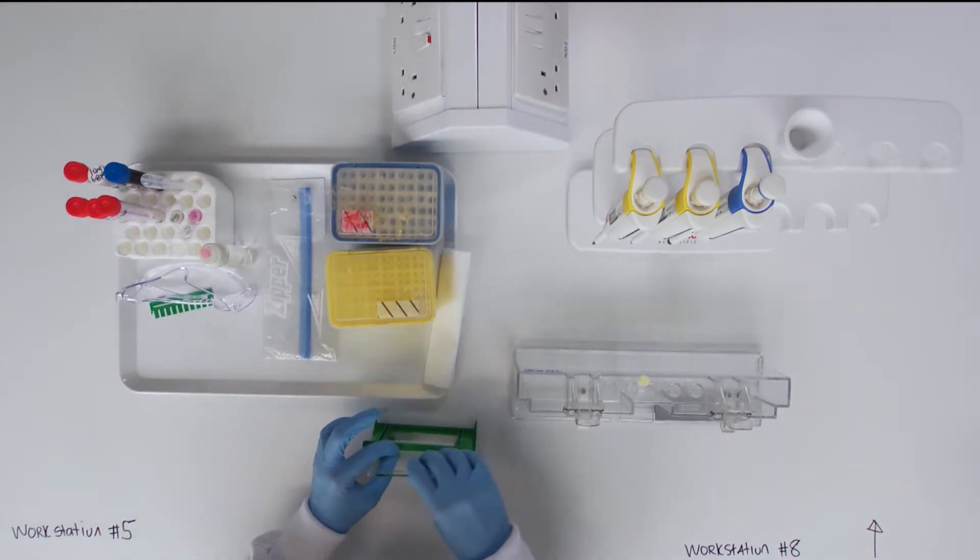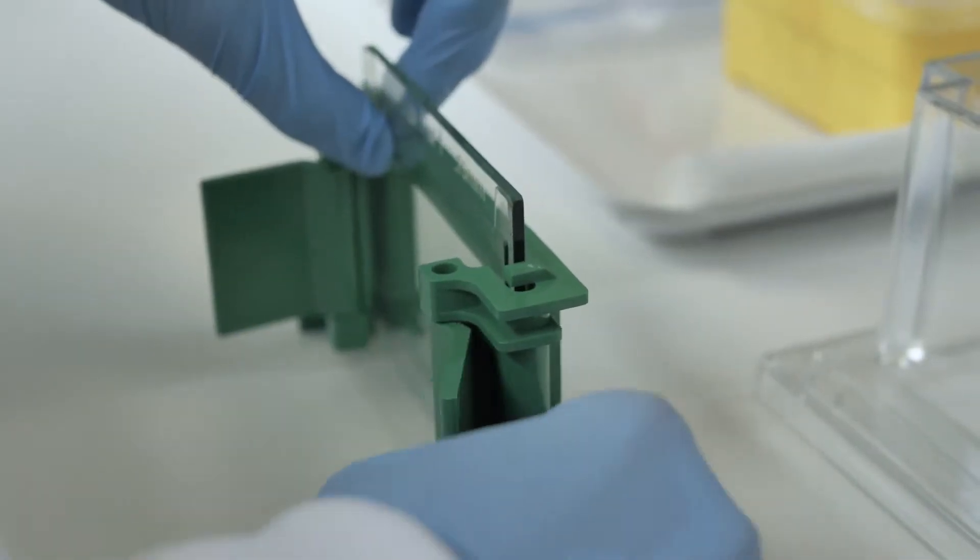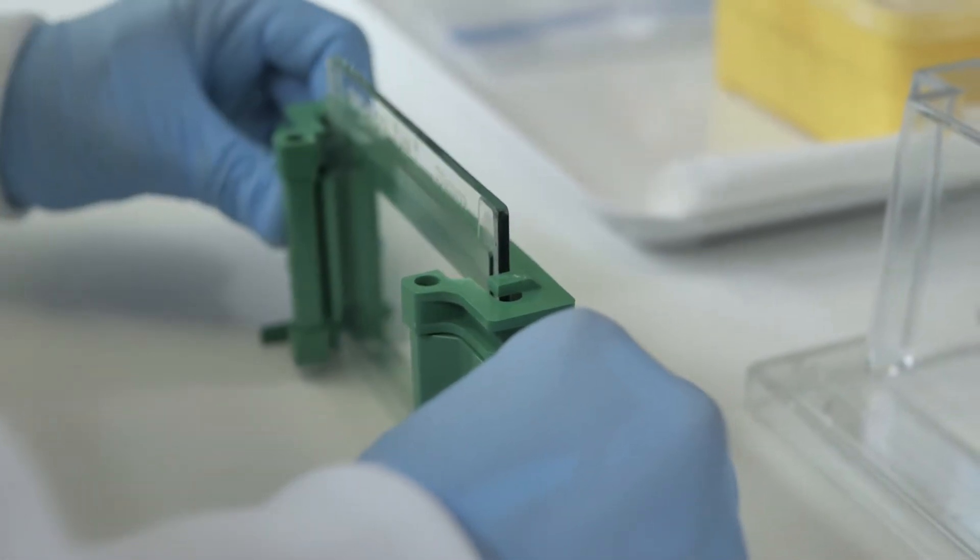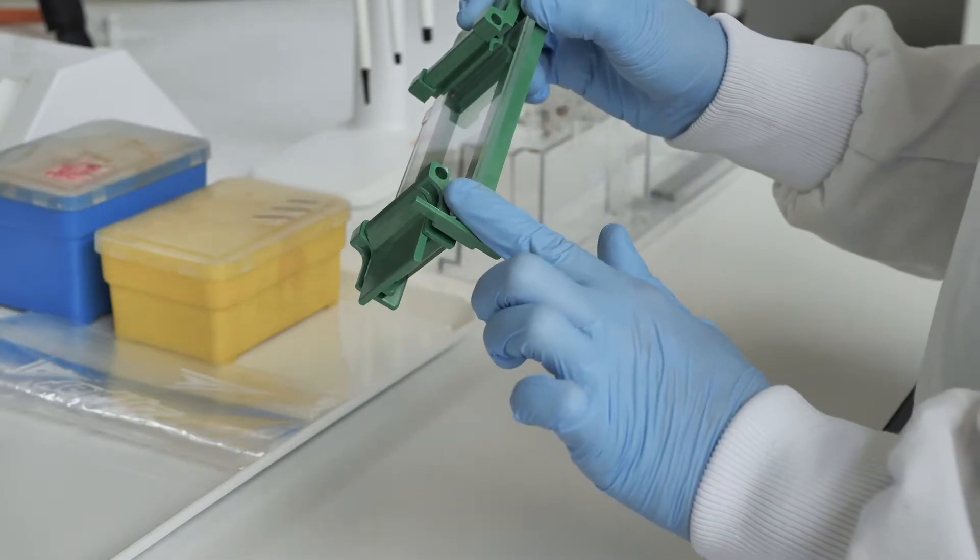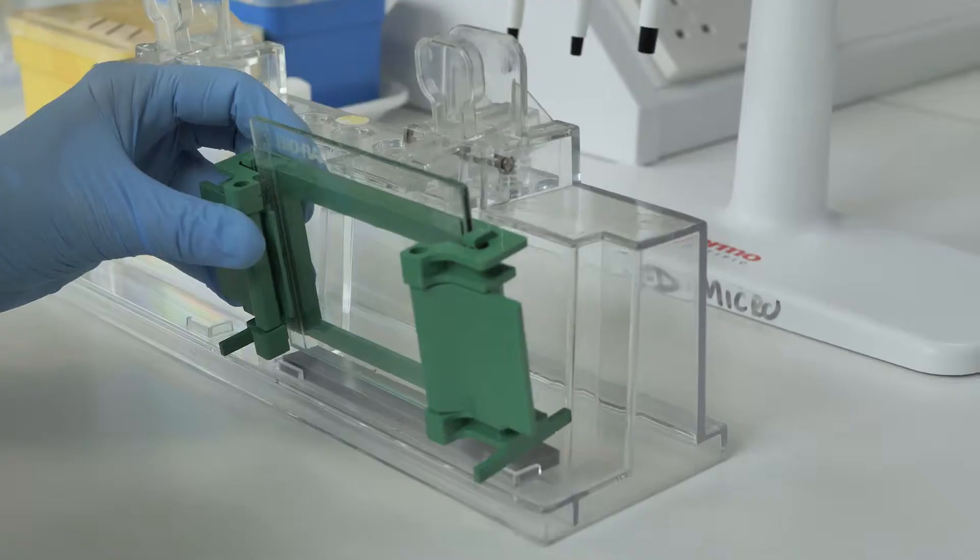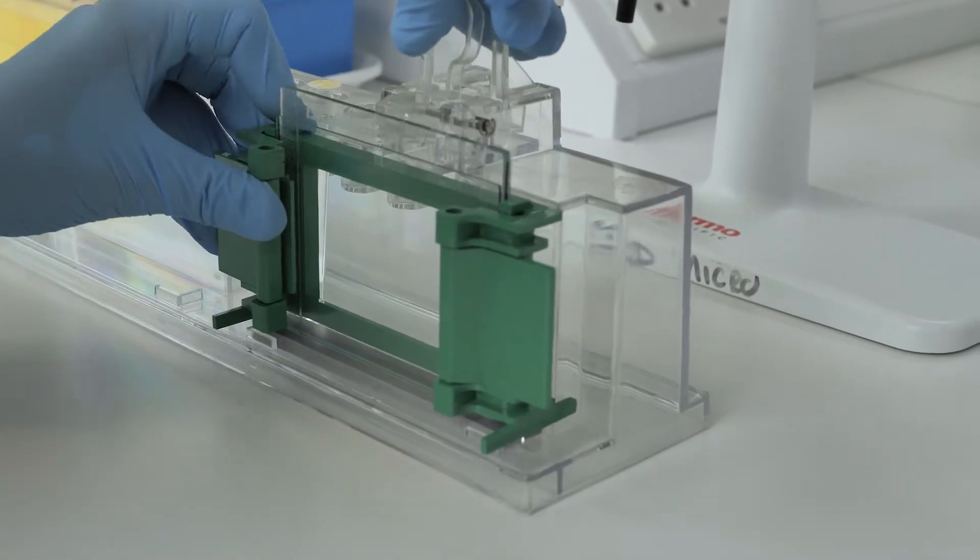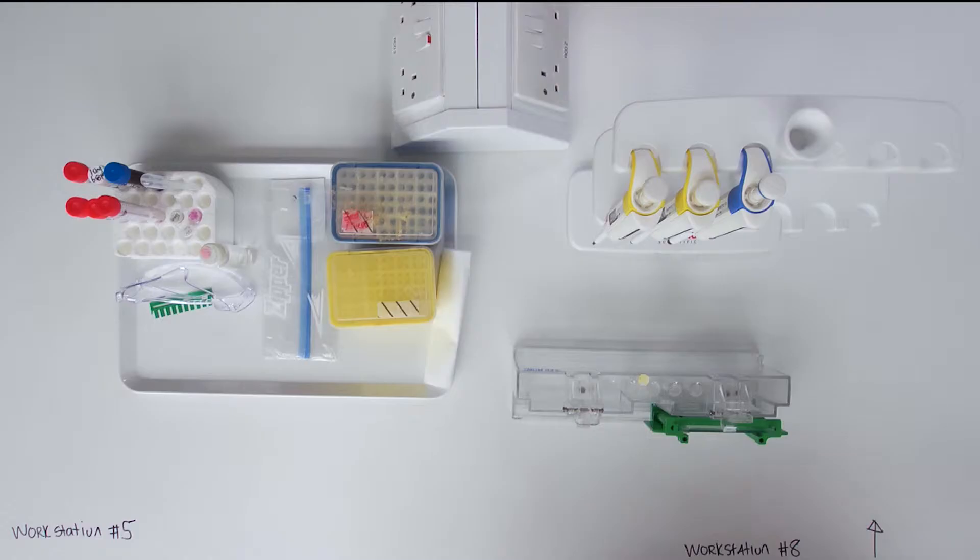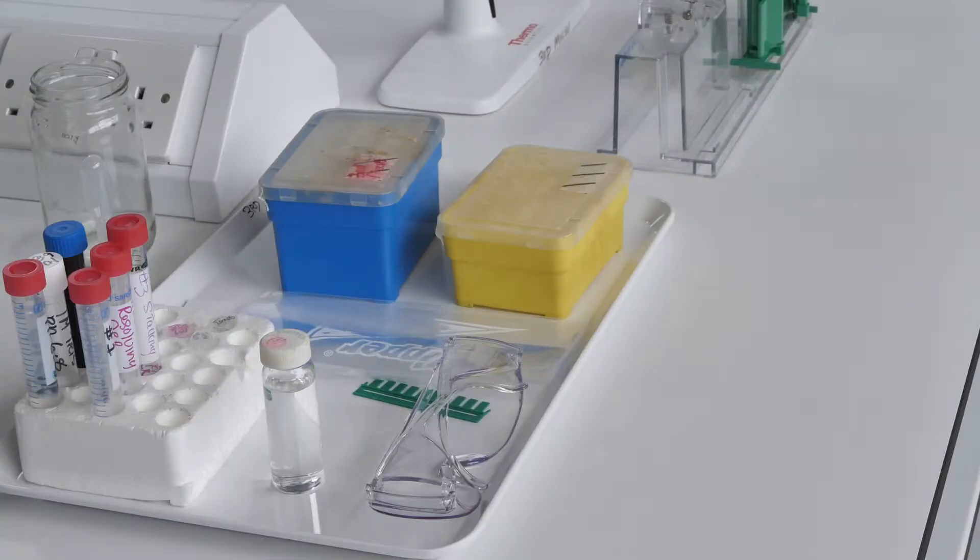Assemble the gel plates by placing a short plate on top of a spacer plate. Insert the plates into the casting frame and clip to secure them. After checking the plates are flush at the bottom, place the frame in the casting stand provided at the side with the grey foam rubber gasket. When the sandwich is ready on the casting tray, you can begin preparing the gel.